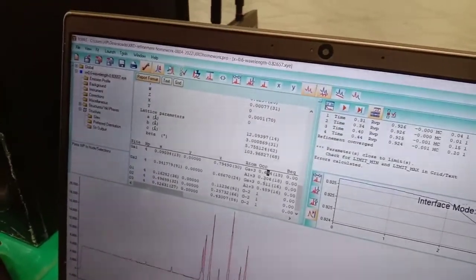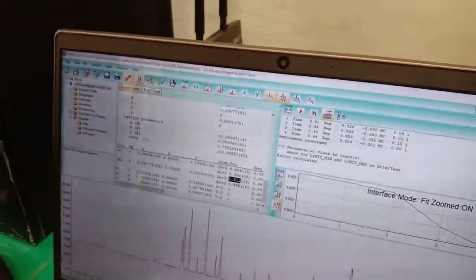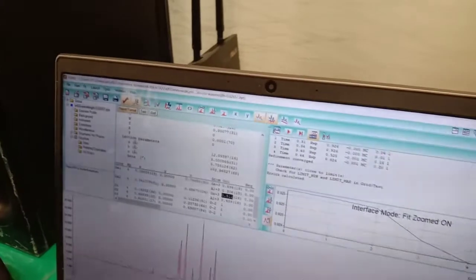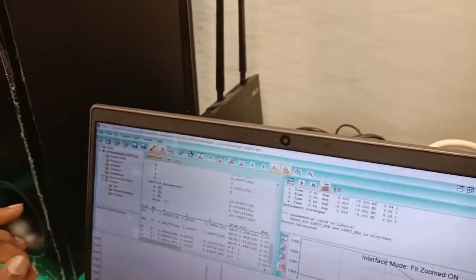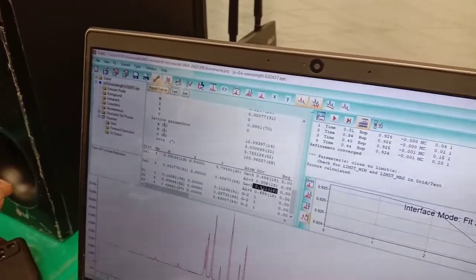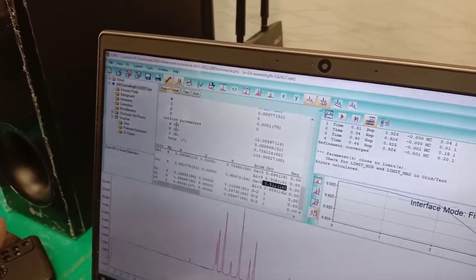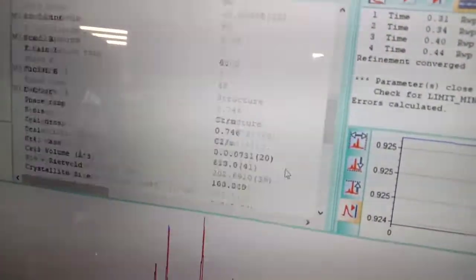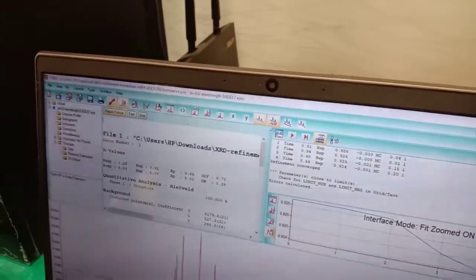Let's say the value may be like 0.511 plus or minus 0.016. So you have to read it like this. It's the standard deviation. So it may be like 0.527 or maybe 0.4974, something like this. Okay, now I understand that value. The error is very important.